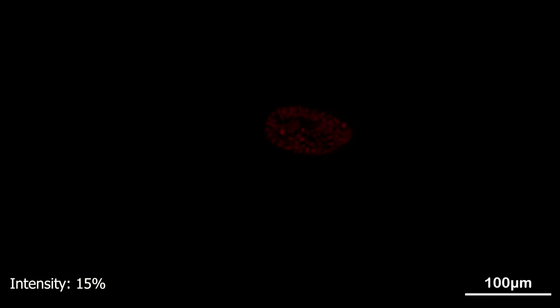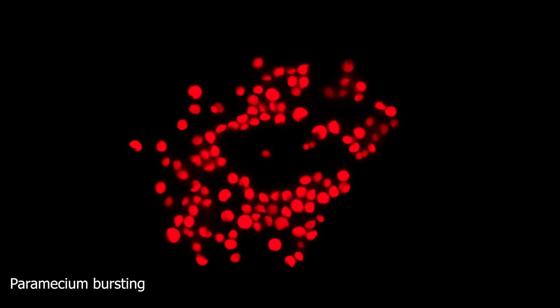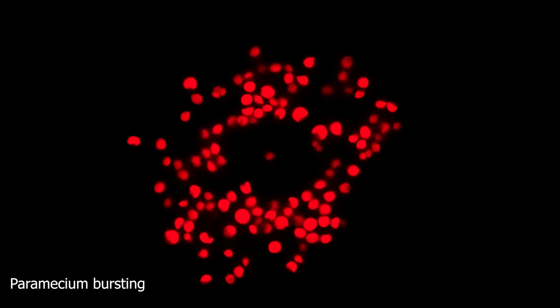However, with the extremely focused light of a microscope, we can push the algae to their limit, saturating the capabilities of their protective mechanisms. When these systems are saturated, more and more reactive oxygen species are produced instead, leading to the oxidation of all macromolecules, ultimately killing the cell.